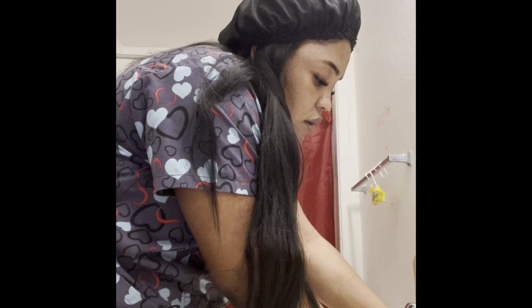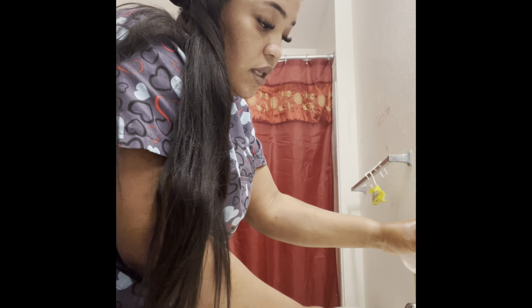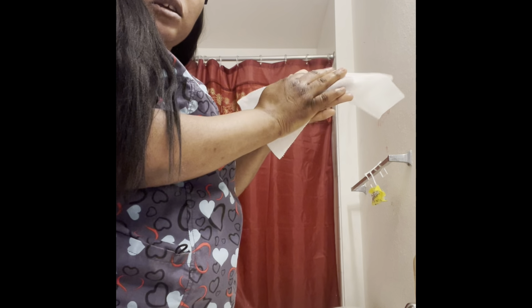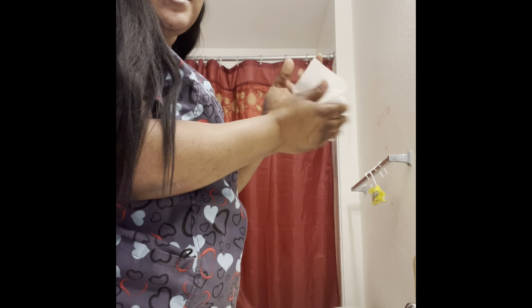Once it gets to 20 seconds, we rinse our hands. And you do not touch this. You use another towel to close it, and you throw it away, and you use another napkin to dry your hands. And when you dry your hands, always make sure that you just tap a little bit. You don't just do it like this. It's better. Now, since my hands are dry, I'm going to put the gloves on.